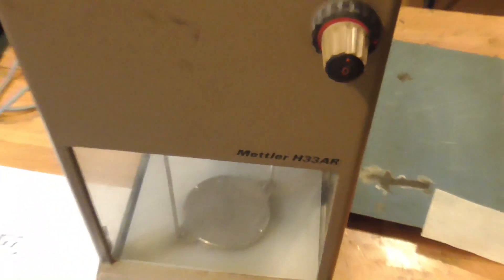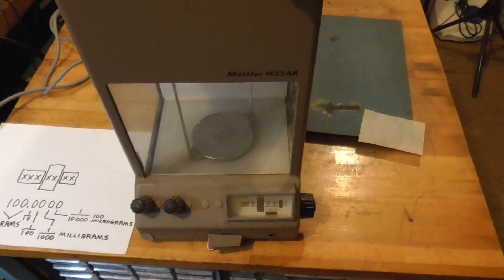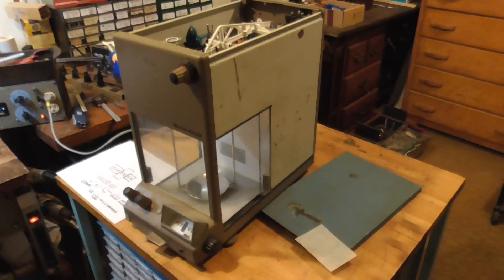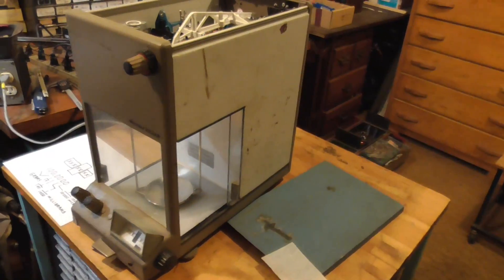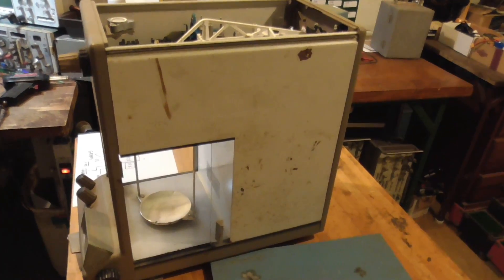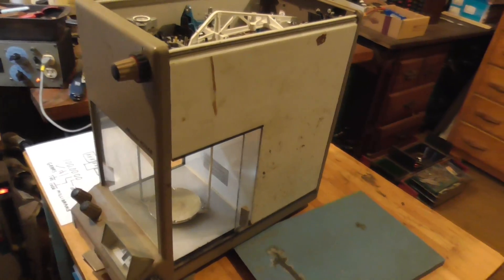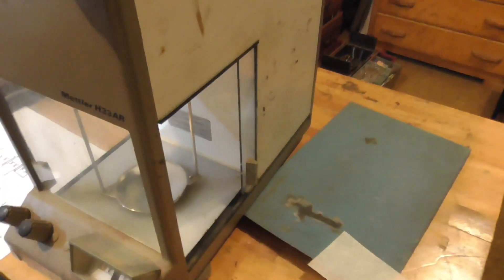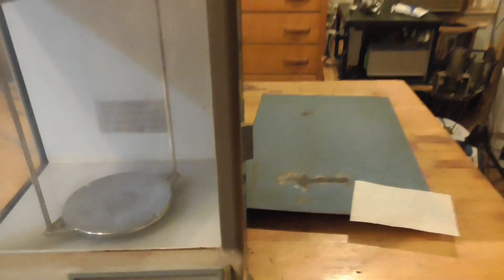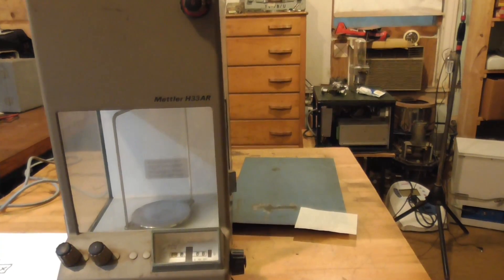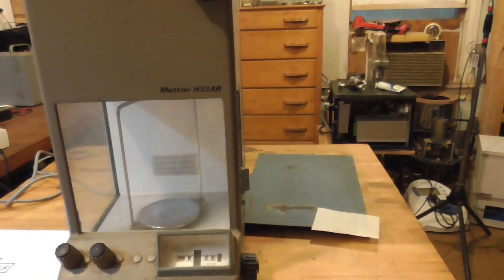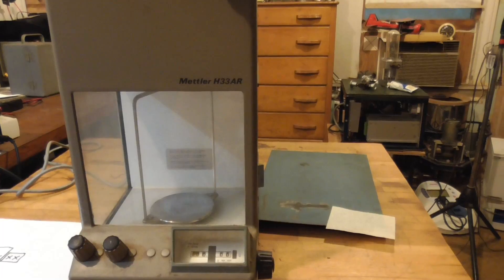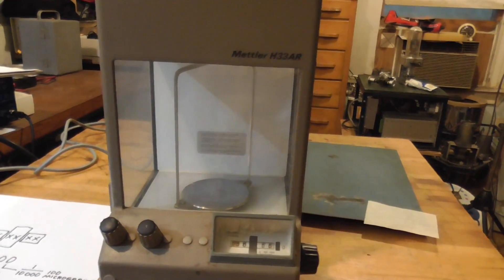Here is an interesting little play toy that I got at an estate sale. It is an antique, almost antique - I mean it's 50 years old - analytical balance. A very, very sensitive scale. Back in the 70s, these were the cream of the crop. They were the most sensitive scales that you could get.